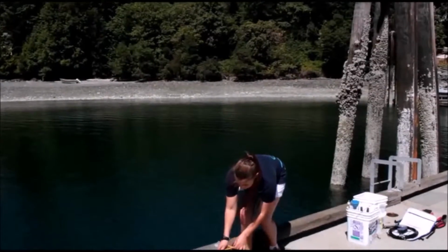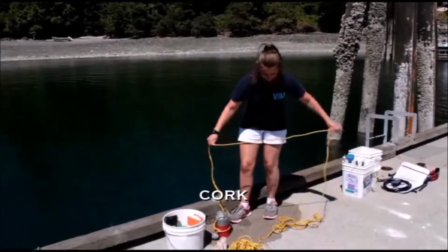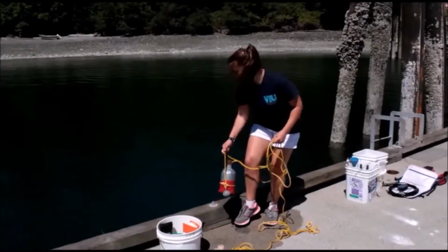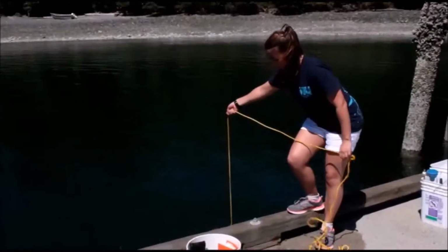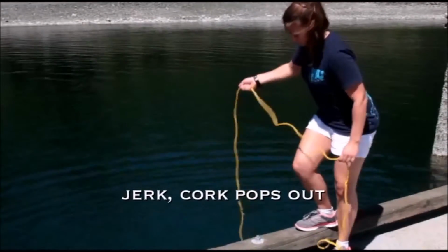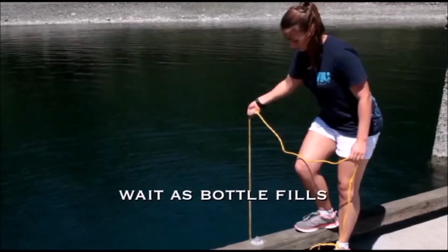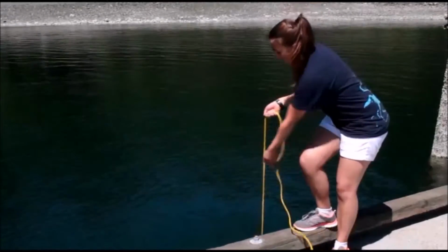Now we'll run through the procedure of taking a discrete sample with our homemade sampling bottle. You cork it, find the measurement for your sampling depth, and lower it to sampling depth. Wait for a few seconds so the water can settle down, and give it a tug. The cork pops out and water pours in. Wait as the bottle fills, and then bring it back up.